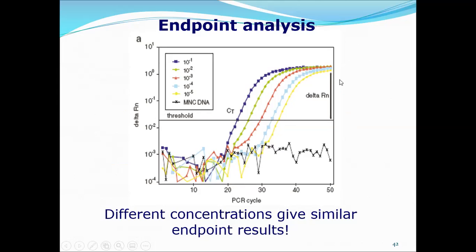The conventional PCR actually measures at this particular point and not in the exponential phase. So that is why people choose using the qPCR, where you actually get to know the real-time amplification, and if it gets amplified earlier, you have a higher copy number.